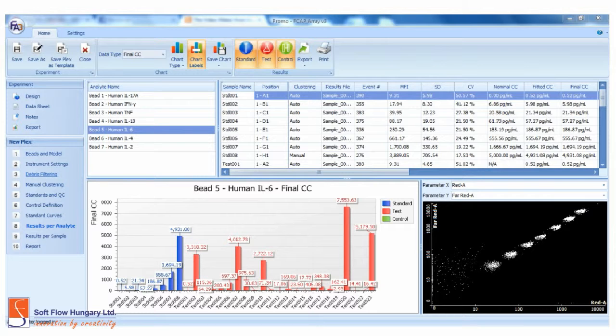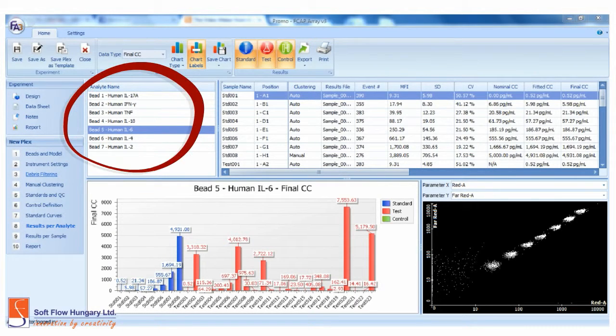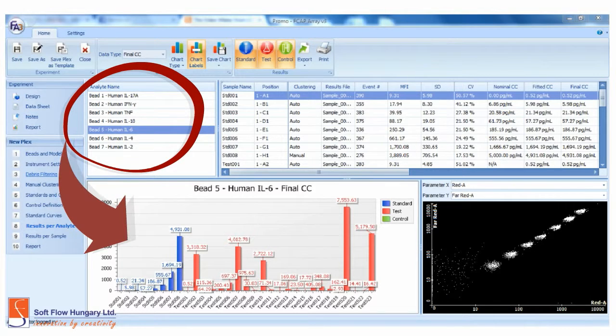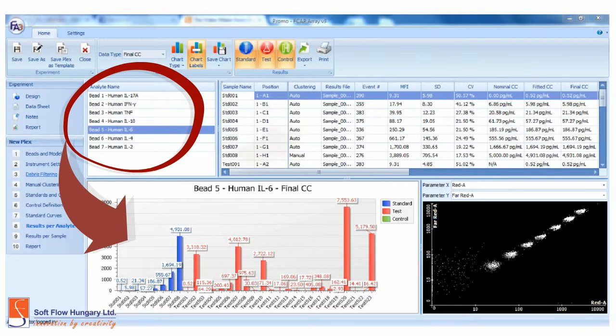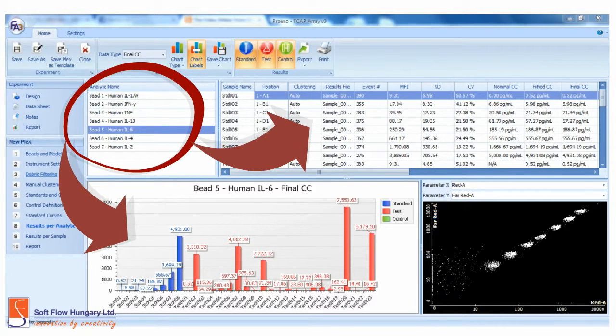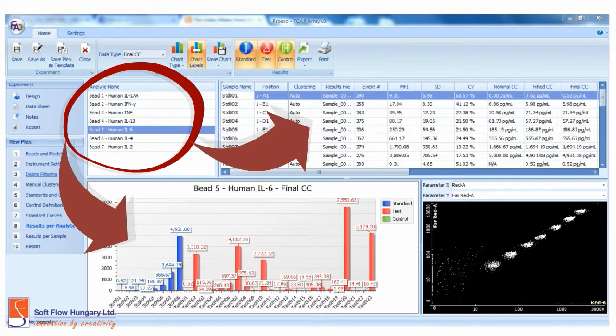This is the screen for results per analyte. Note this part. You can see the results related to each bead and also see the results for each sample. Here you can find different data results for the samples, including the final concentration.